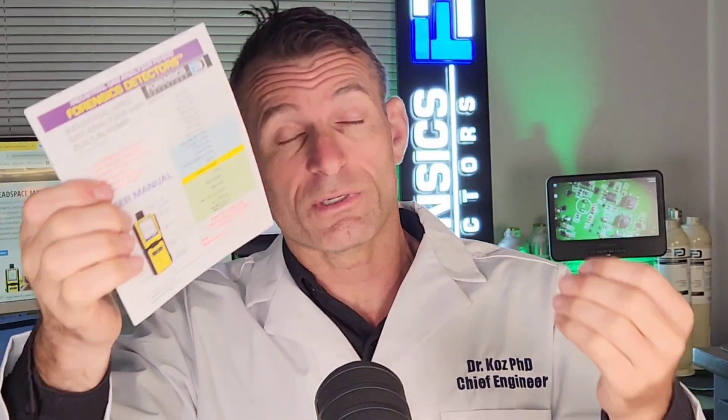What do you get with this unit? You get a nice carry case with the unit so you're organized. You get your analyzer with needle and filter. You get your septas, which are very important — you place them on the product and then you put the needle through. You get your charger, your USB cable, your user manual in full color for training staff, and a calibration certificate traceable to NIST gas sources, which means the unit will be accurate and showing you the correct carbon dioxide values.